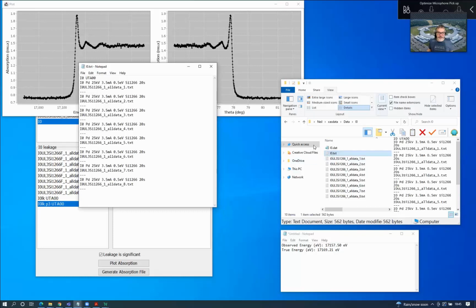And in this case, the text file summarizes, let's see here, what have we got? We've got the individual file name of each data file. We've got the header from each data file, so there are 8 of those. And at the top is the data file that was written. Okay, so again, it allows you to keep good curation of your data by reminding you of which data were integrated to give a particular data file. Personally, I find that very helpful.